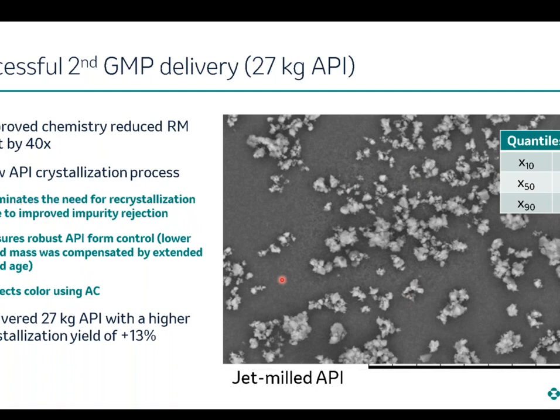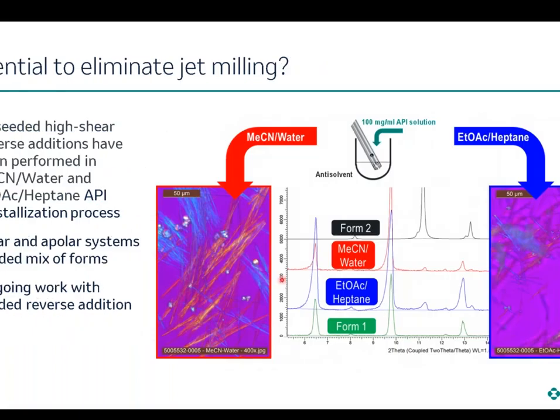So something that I'd like to point out, which is still ongoing, is the question if we can eliminate jet milling. So I've started here with small scale preliminary testing, to see if, in a high shear environment, we can generate the particle size and form control required. And from the initial experiments, it doesn't look like that.